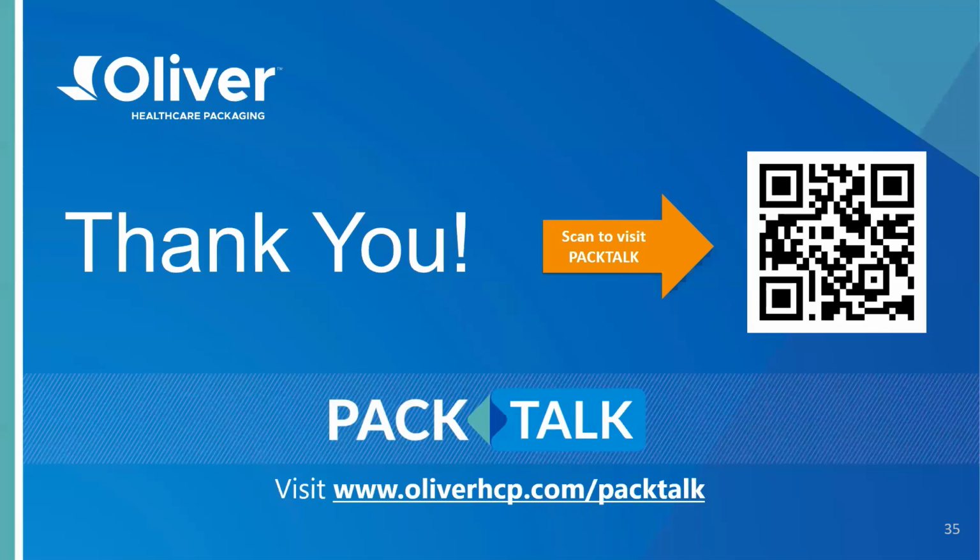Now, on the other side of that coin, if the product can't be accessed, then that's a potential problem. So it really depends on the type of tear. I hate not answering the question, but it does depend on the type of tear. It also depends on what your risk assessment would have been, and what's acceptable and what's not acceptable. If it's encapsulation and you can't take it out, then that's a serious problem. But yes, I would refer back to the type of tear, unfortunately.